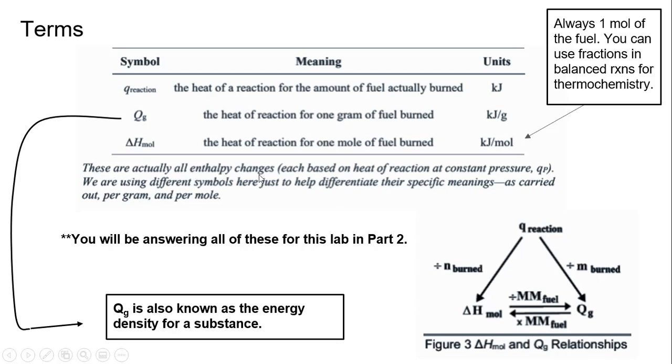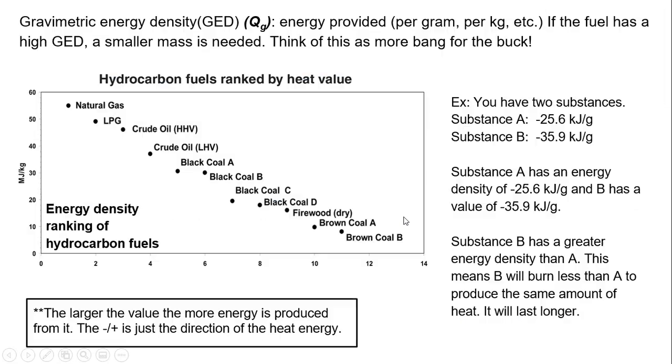These are all actually enthalpy changes, but they broke it up into different terms so as not to get you confused in this lab. Again, you're going to need these parts for lab 2, so it would be really handy if you kept your PDF close by to understand what's being asked. And if you get confused, if you know the units, this will help you solve problems.